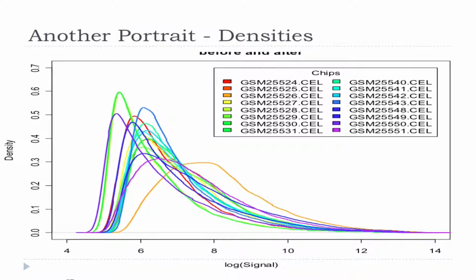With this one, for example, you can see that the estimate of expression is actually much higher, and it's much broader. It has a broader tail. There might be a reason to believe that that's the case, but typically, we don't make that assumption. We make the assumption that these distributions should be somewhat similar. And by somewhat, I really mean somewhat. In some cases, we're going to assume it's identical. In some cases, we're going to assume that the variance is very similar. In some cases, we're just going to assume that the mean is the same.